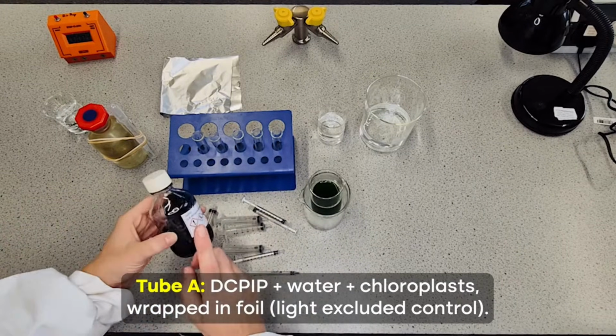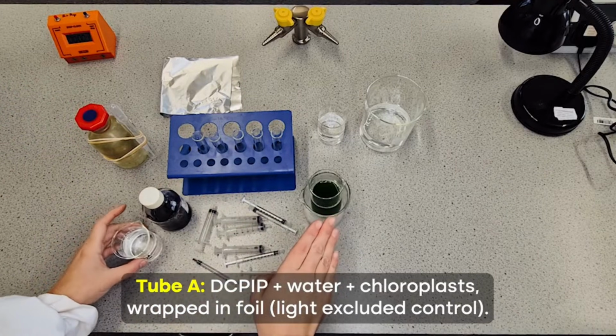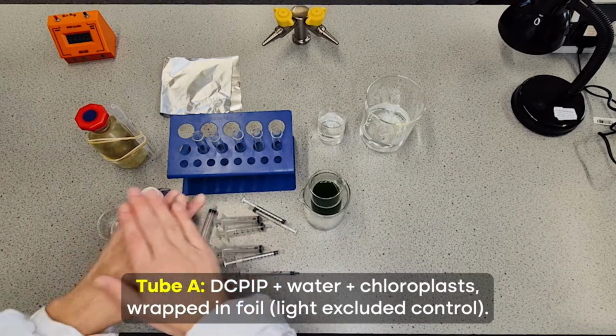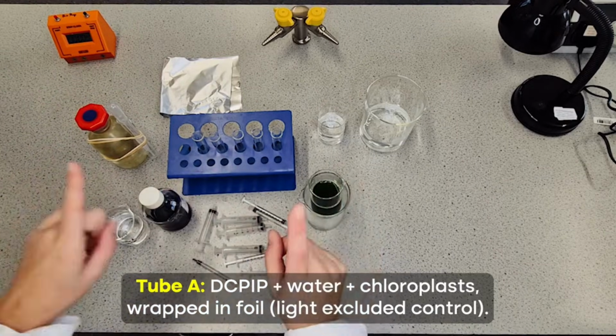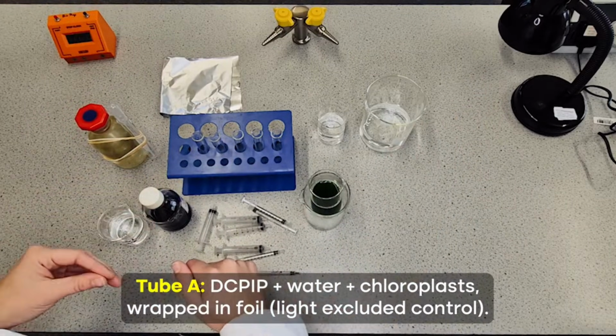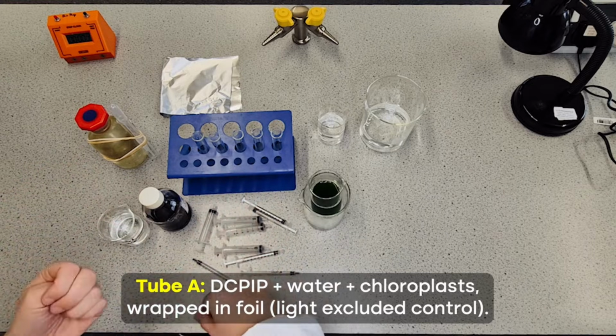This is going to have DCPIP, distilled water and chloroplast solution, and we're going to wrap it in foil. So this one is going to be our control experiment. We're setting up exactly the same as the others, except we are blocking out the light source. So we're going to add the foil to block out the light. This control experiment is going to be proving that if you don't have light, the reaction won't happen.